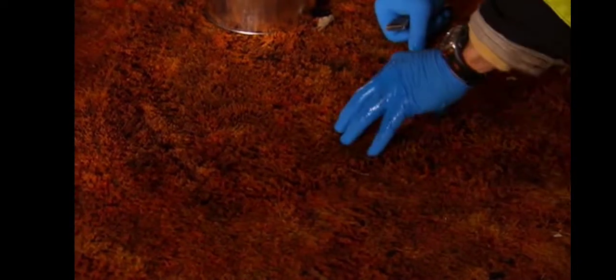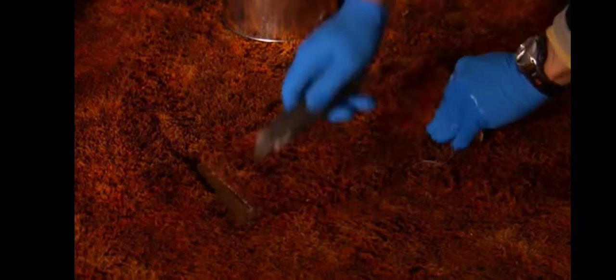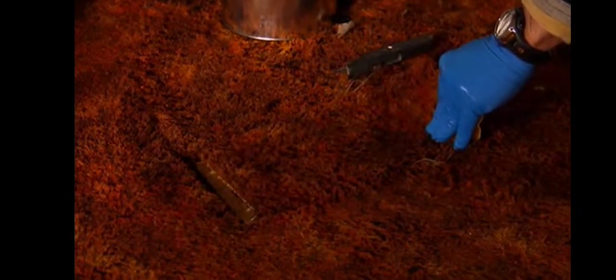In some of these situations, it's important to get what's known as a comparison sample. So if you go to an unburned area of the environment that you're in, and using carpet as an example again, pick up a nice clean piece of carpet if that's possible, submit that as a comparison sample, so we can analyze it in conjunction with the samples that were submitted as unknowns.